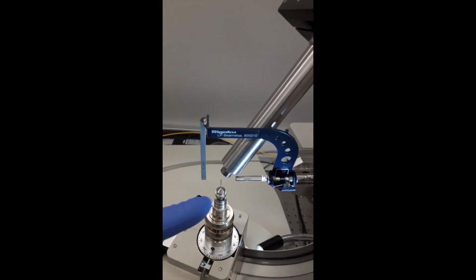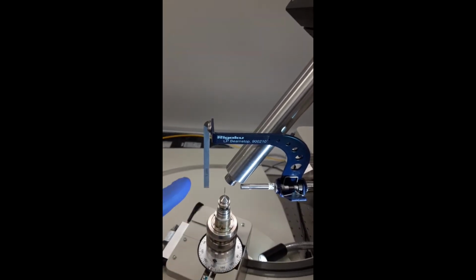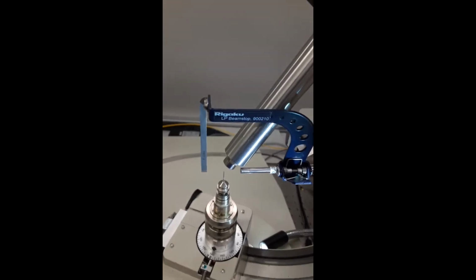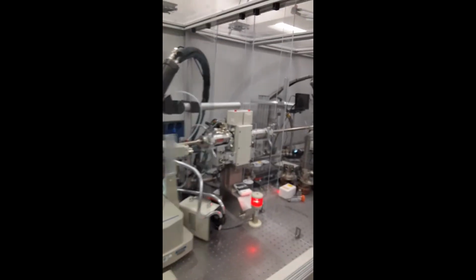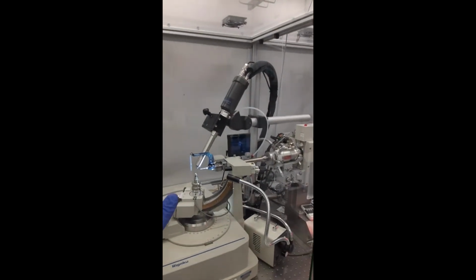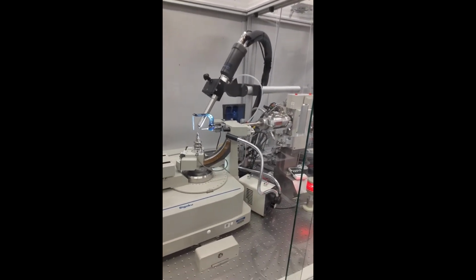So again we have our X-ray collimator coming out here, our beam stop, our sample centered, and our cryostream keeping the sample cold on the goniometer. At this point we shut the doors. And I can push the shutter button here, and that arms the system so we can control it with the computer.